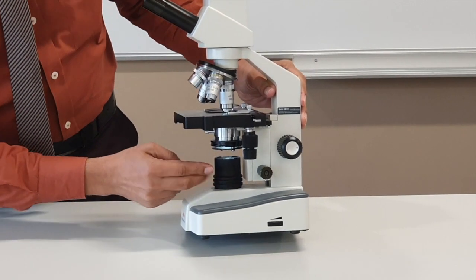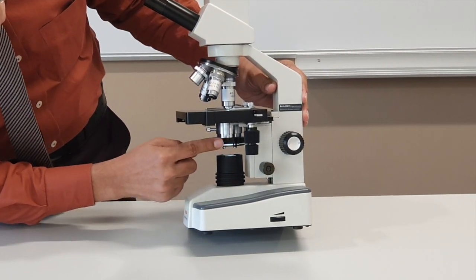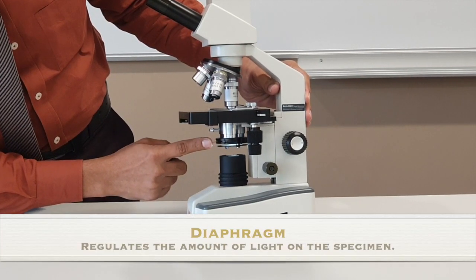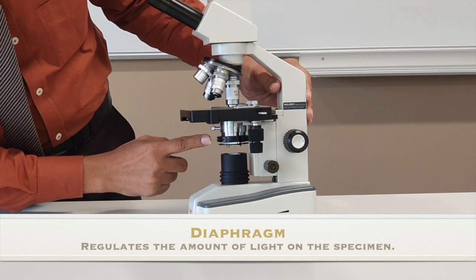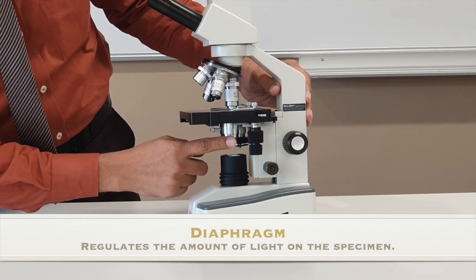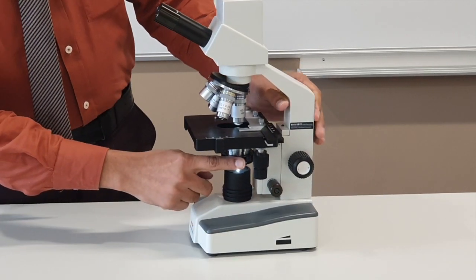This is the base, then the lamp that is used to supply the light so that the image is clear. Just above the lens, you can see this small knob that is called the diaphragm. The diaphragm is used to regulate how much light should pass through the slide or specimen.